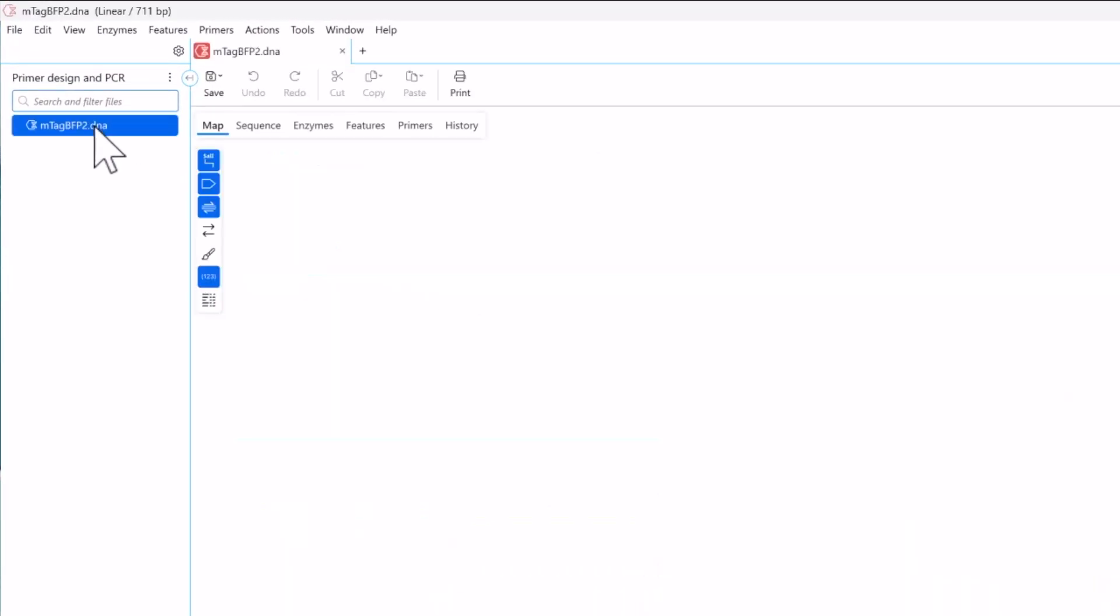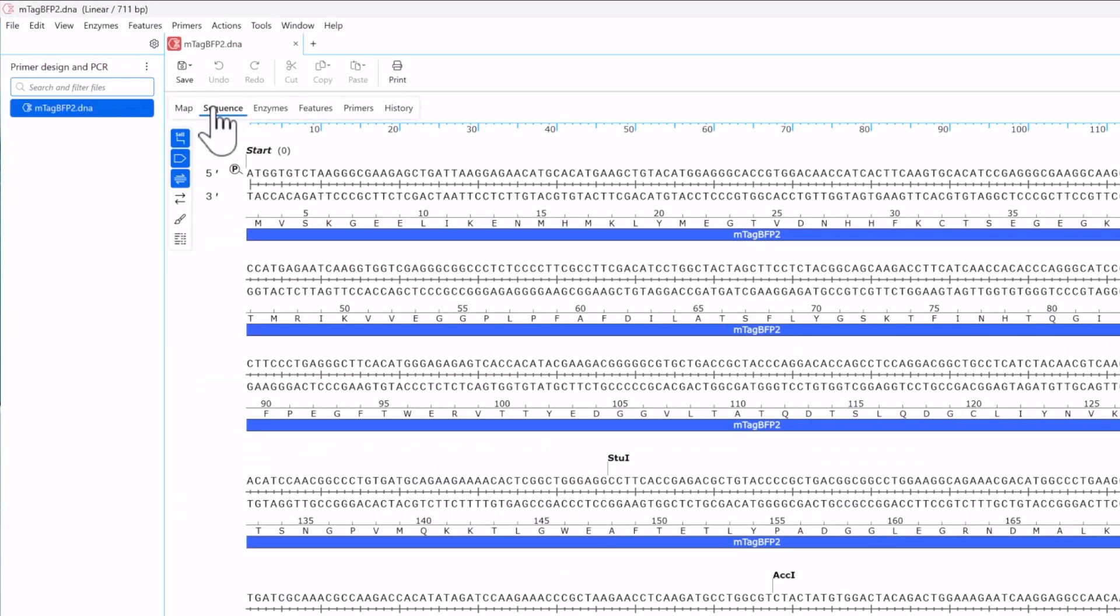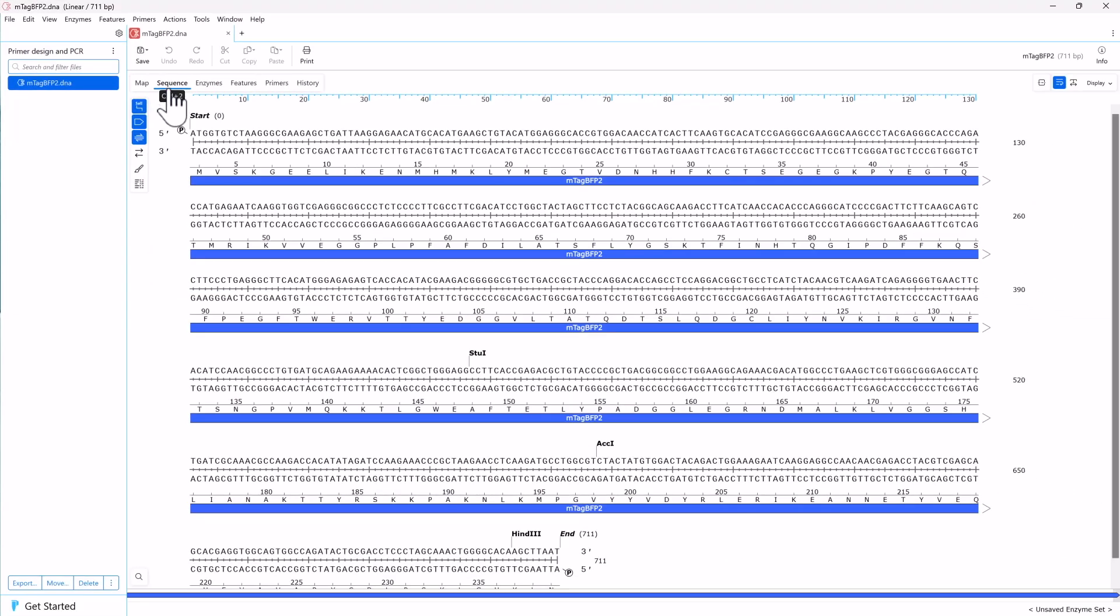To start, open your sequence of interest, switch to sequence view, and locate the region for your forward primer.